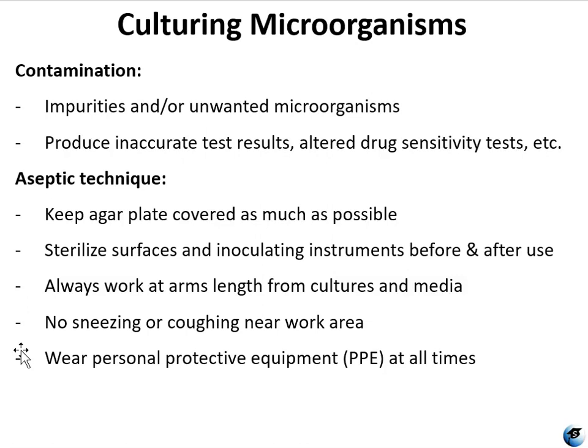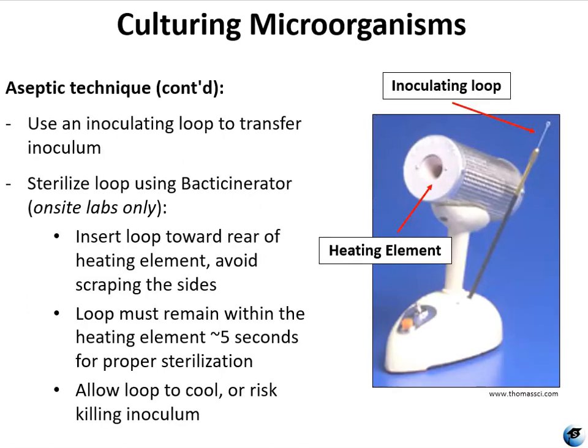And you want to keep everything covered as much as possible. You always want to make sure that you're not having things too close to your face, you're not breathing into your plates, and don't sneeze or cough while doing your lab procedures. And if you can't help it, then you can sneeze into your arm or wear a face mask. Another aspect of using aseptic technique is using sterile media and sterile equipment.